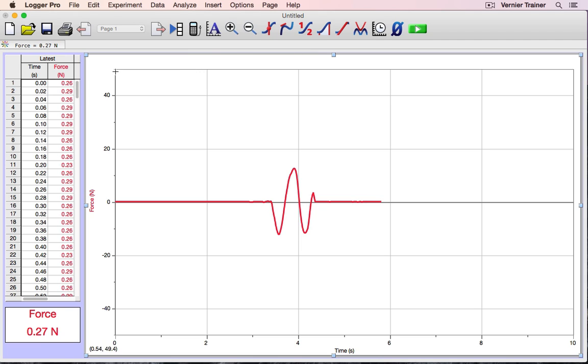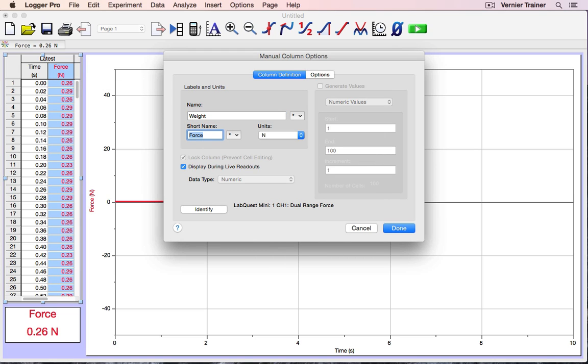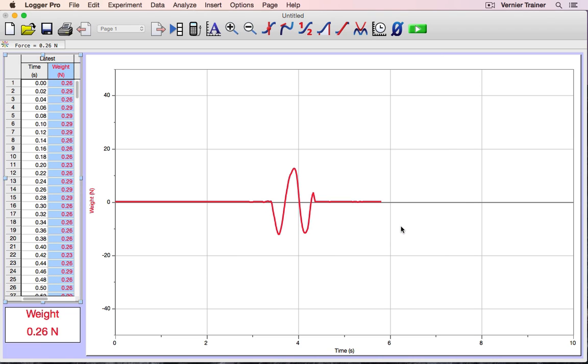For instance, if these force values represented weights, and I wanted to change this from force to weight, I'll double-click on it, and it opens the column options menu. I'm going to change this to weight, and it has a short name called W. Done.